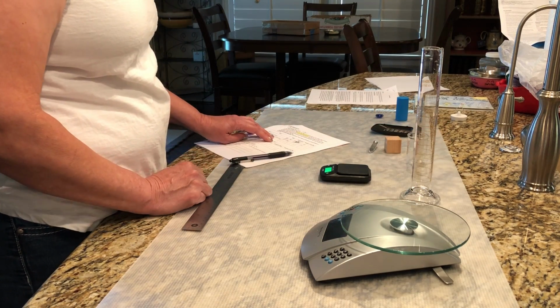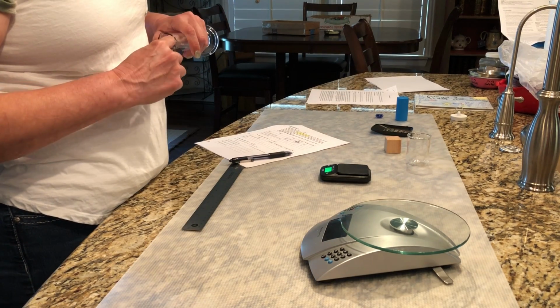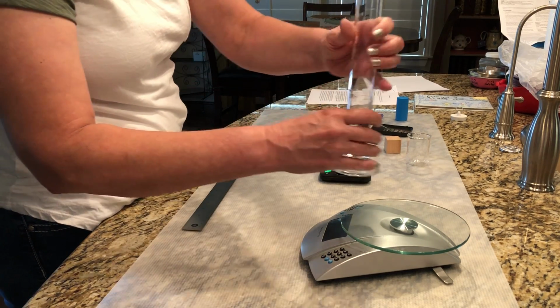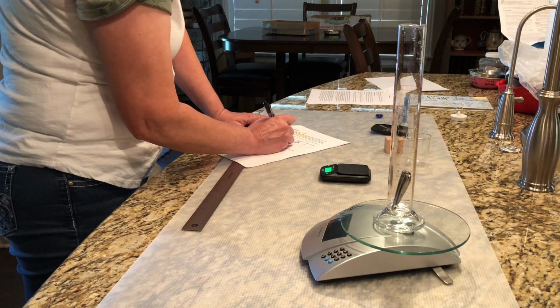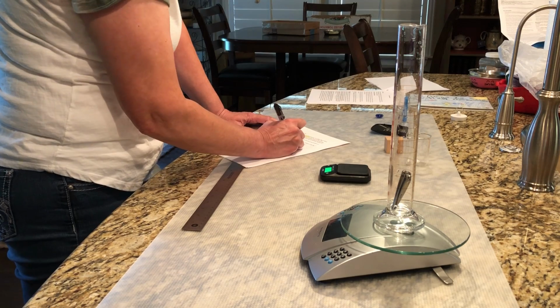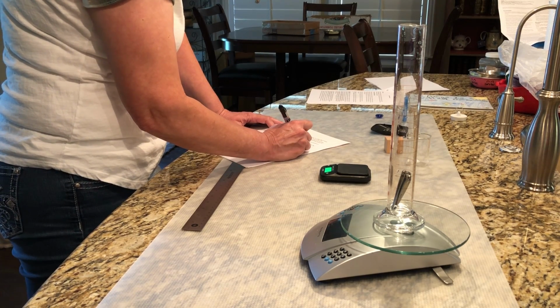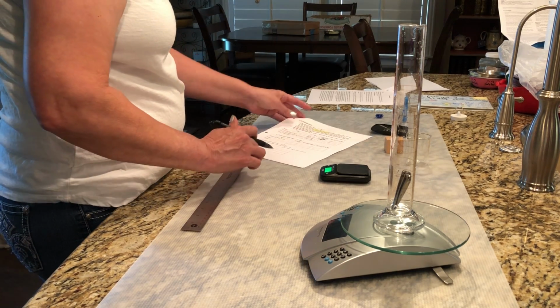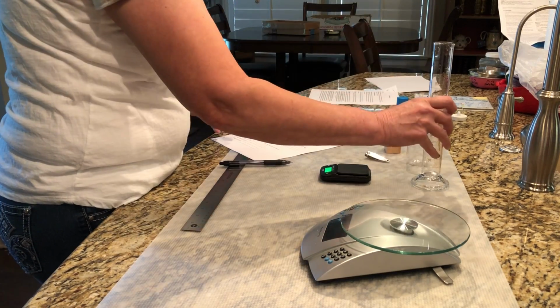Okay, now we're going to do the cylinder with the nail cutter inside of it. Try not to break it. It's tared. So the weight of those together is 0.151 kilograms. The 1 would be the estimated digit, and the significant digits would be 3. All right, take that back out.